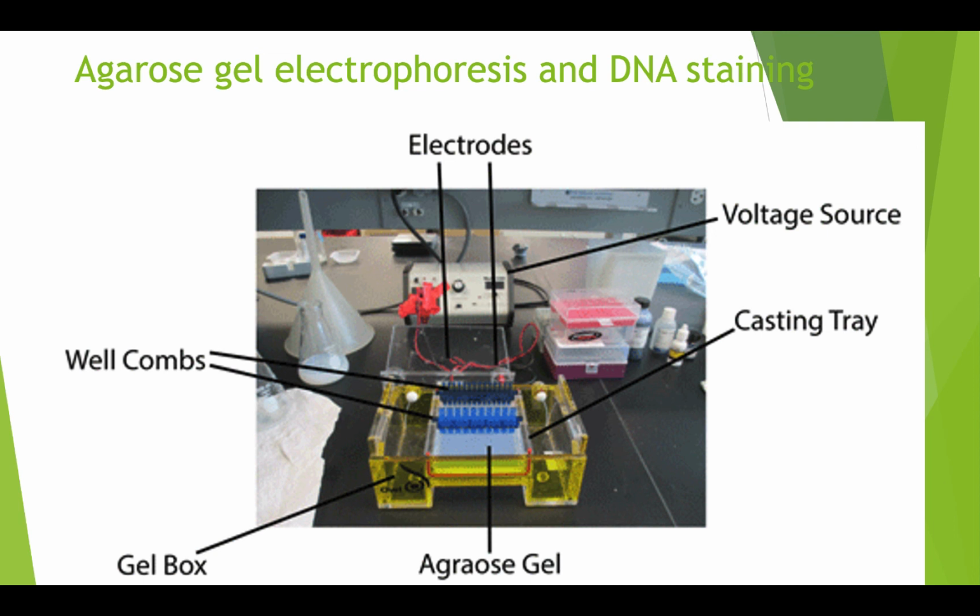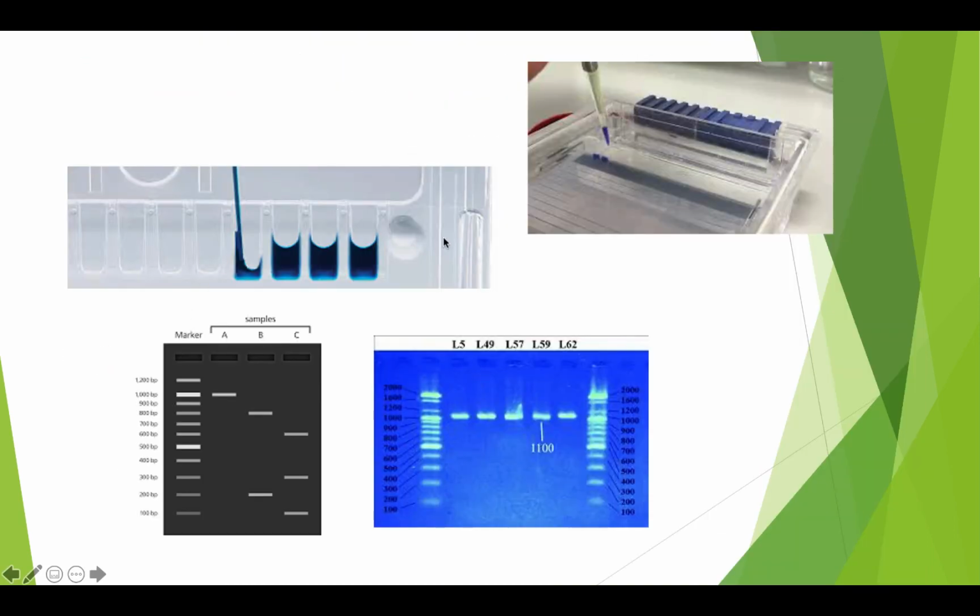You have to go get the DNA. After you finish the reaction, you take it and clean it. There's cleaning for the PCR, though sometimes you can use the PCR product right away. You add a dye so you know where you are in the gel, and then you load your DNA into these wells. You add the DNA after you dye it.